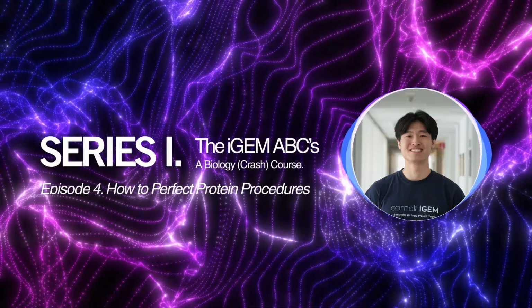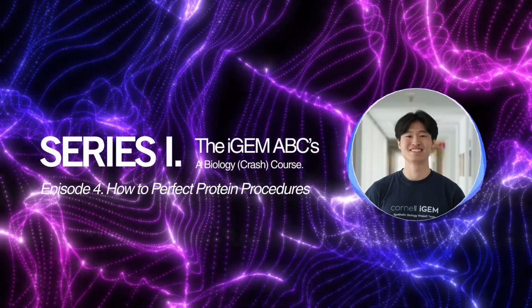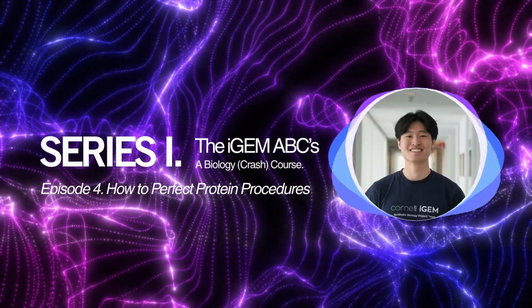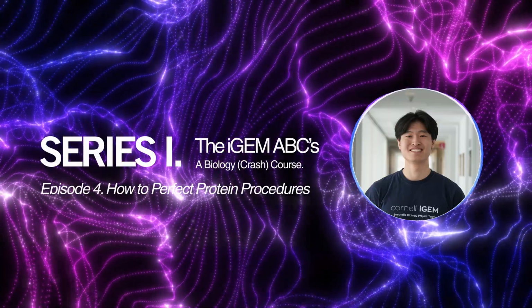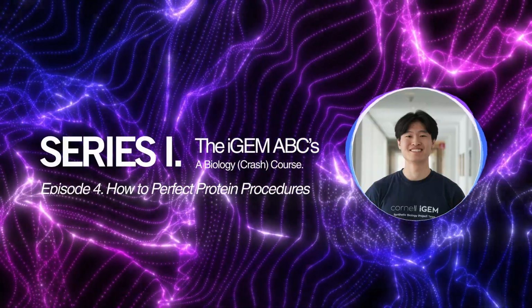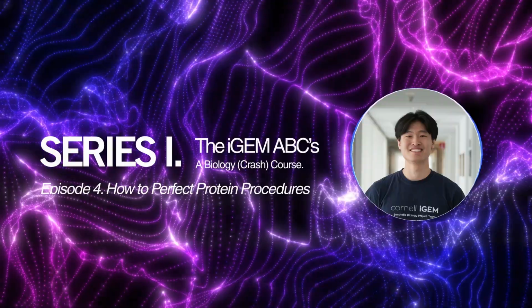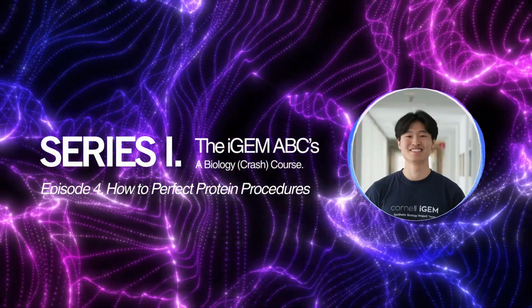That's just one example though. There are other examples, like colorimetric assays. So for example, let's say you had a protein or enzyme, and what it did was it broke down this compound, and the new compound actually caused the color of the solution to change, right? That's another way to assess the activity of the protein. And what's interesting is when you have controls, when you bring in experimental designs, right? Now you'll have multiple variants of the same protein, or you can have controls with no proteins, and you can assess the enzyme activity.